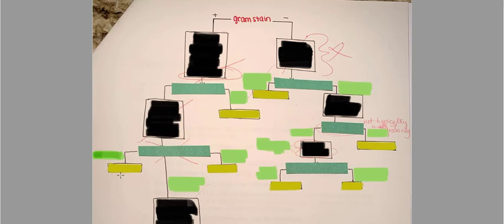So you can see all of the yellow ones are individual organisms, so that after that test is complete, you can say, this is positive. If it's positive, it's this organism. Or this is negative.